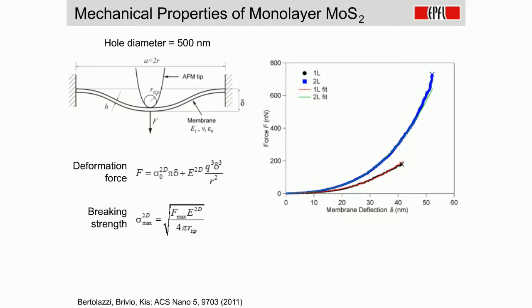to, for example, integrate them into flexible substrates, or you could maybe also use this strain to modulate the basic physical properties. The fact that you can apply such large strains has prompted a lot of theory groups to calculate the effect of such large strains on quantities such as band gap or electrical and heat conductivity in this class of materials. They found very early on that you could have a very strong modulation of the band gap. By applying strain, you could start shrinking the band gap, and you could even fully close it around the breaking strains in this material.